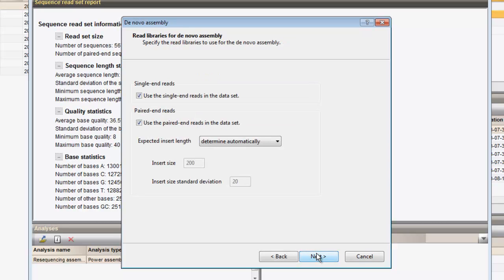When working with paired-end data, the library insert sizes can be defined in this page of the dialog. Paired ends are typically used to optimize the assembly in regions with repeats larger than the read size. Otherwise, repeats longer than the library fragment size cannot be reliably assembled and will create gaps in the assembly.